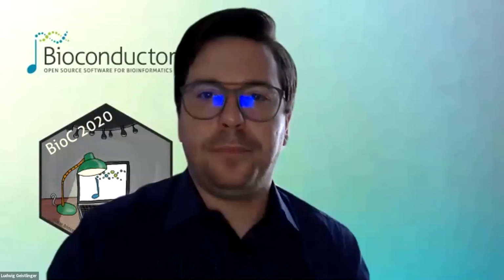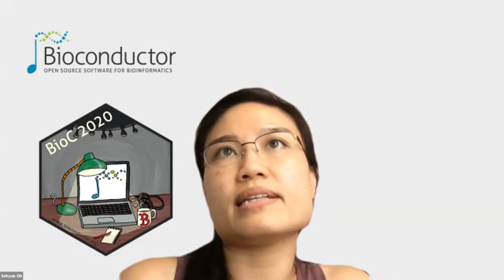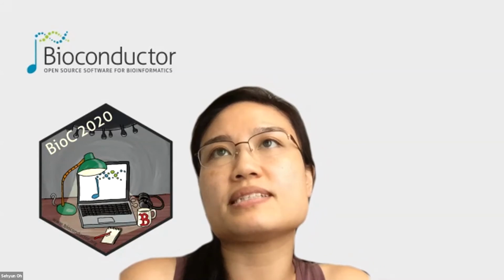it seems quite obvious, but sometimes the likelihood score ranking is somewhat less intuitive. I will still follow that because the likelihood score comes from a lot of other information under the hood. So I will follow the label based on the likelihood score. For example, in the vignette, I will say that this sample is most likely with the purity of 0.6 something, and the ploidy of roughly 2. So I will just interpret it that way.